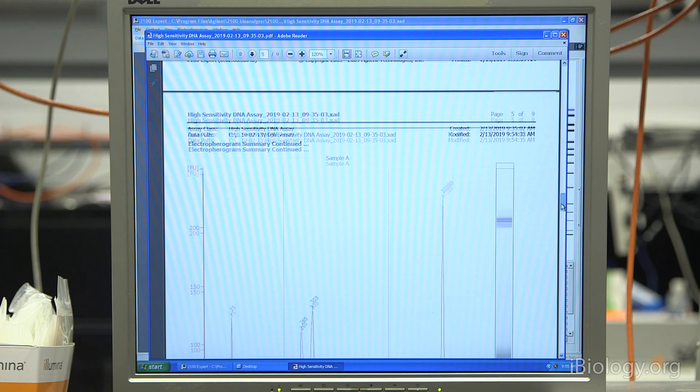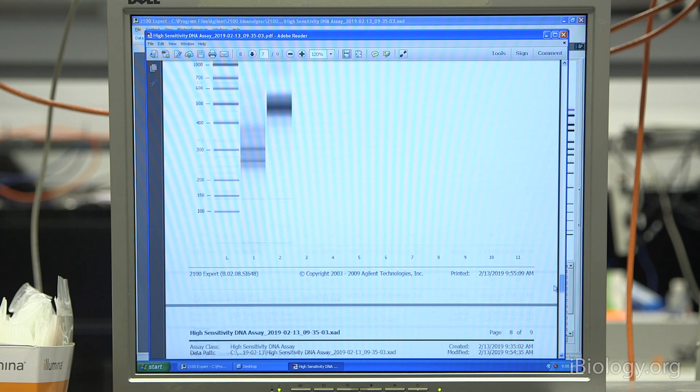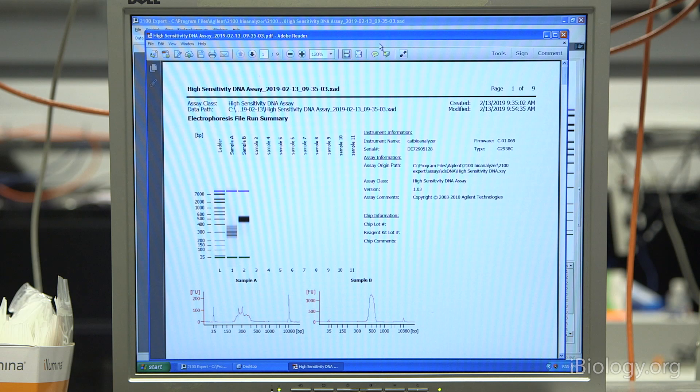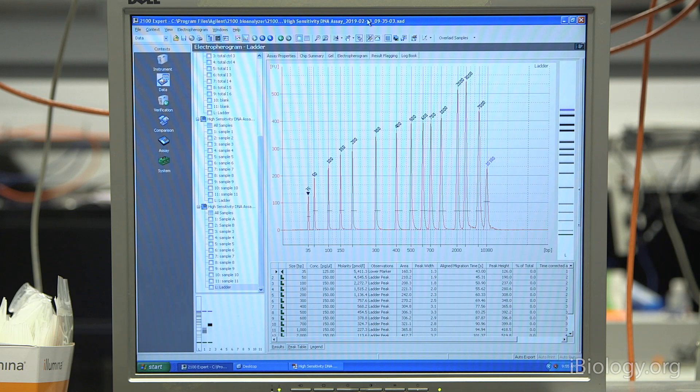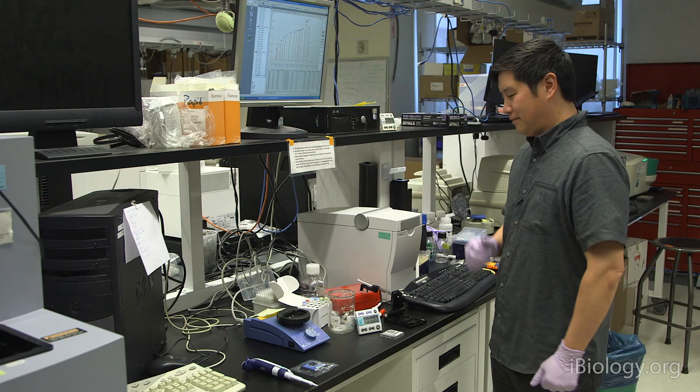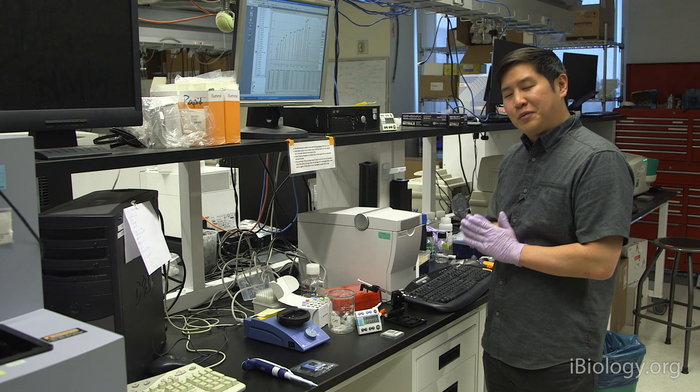These will include some extra information down at the bottom. Most people will want to save the PDF because this is a file they can open on their own computers. You can't open the actual Bioanalyzer raw files, these XAD files, because it requires the proprietary software. You definitely want to export and save that PDF. Generally, this PDF is what you would send off to your sequencing facility if you're getting samples sequenced.